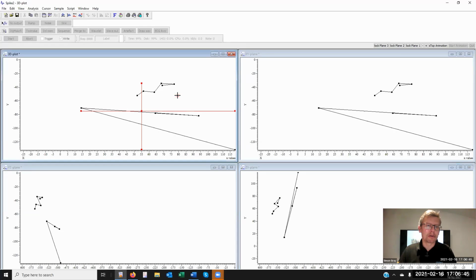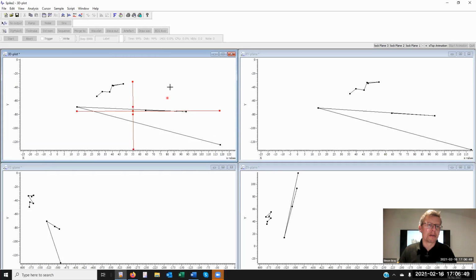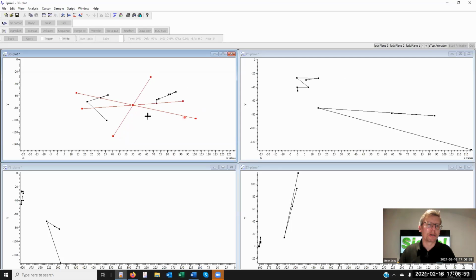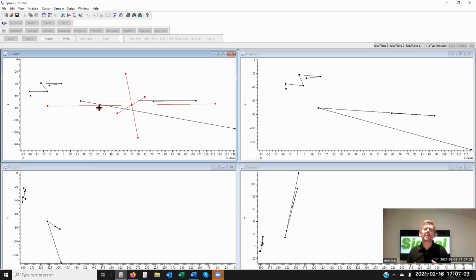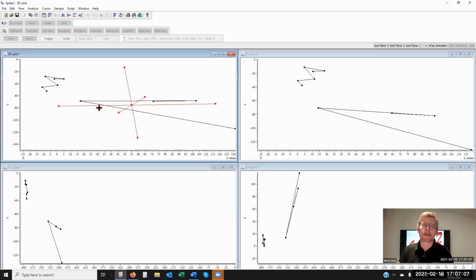Now, if you'll notice in this top left view, I can drag the view around and I can see this little guy on a treadmill moving forward and backward, and I can rotate the view accordingly. So these are still measurement channels, but ones that the script has provided data for, not necessarily directly through the active cursors and into the XY view. So just to give you an idea there.